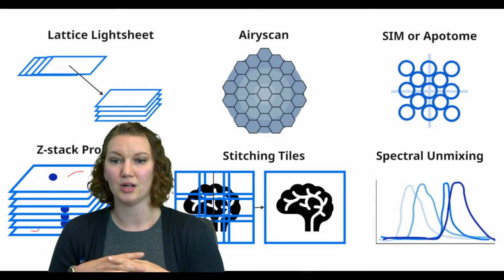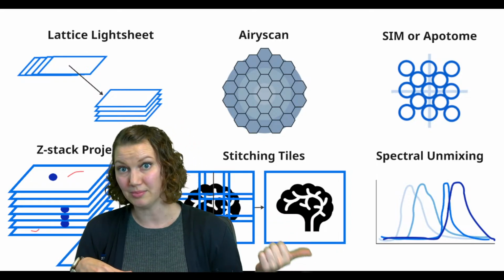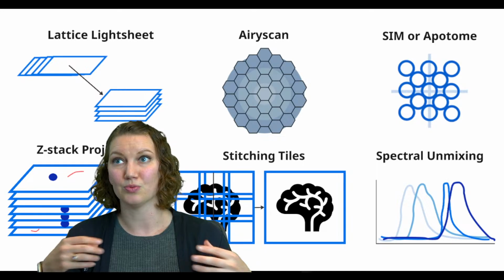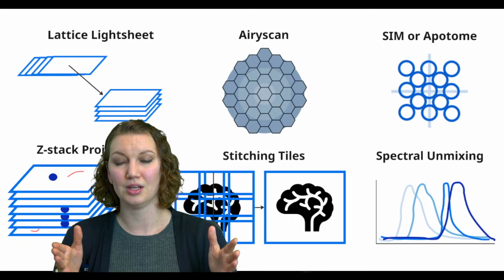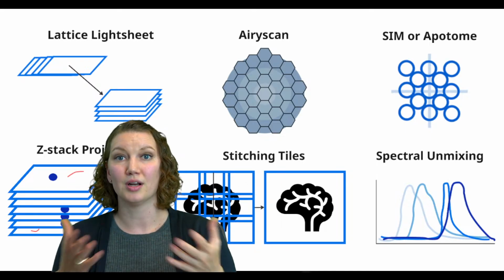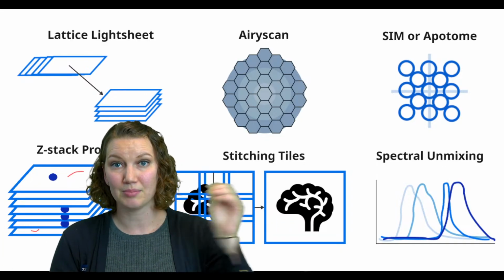And I'll talk a little bit as well about how we can do it with Z-stacks and basically turning those into max intensity projections or spectral unmixing even. We had a really nice micro-minute the other week talking about spectral unmixing, and a reason why that's important is because you don't want to throw away any light, right? A lot of times we have to deal with fluorescence bleed through by cutting off a lot of the light that we are emitting from our sample. Well, if you want to image more gently, then you don't want to cut out any of that light. And so we can capture all that light and unmix it on the fly, build that into your experiment.